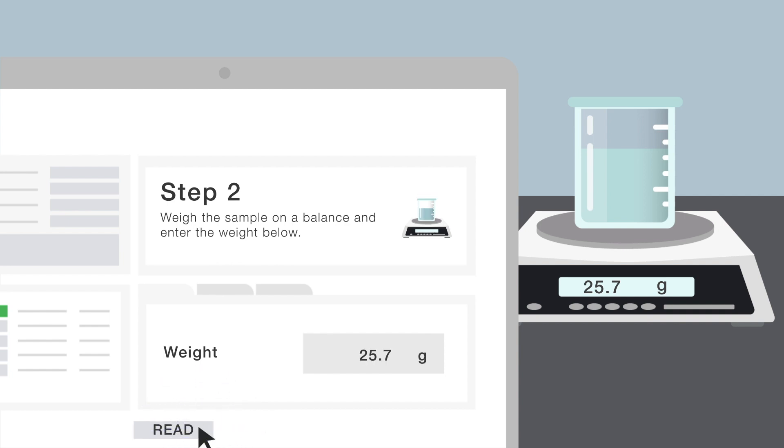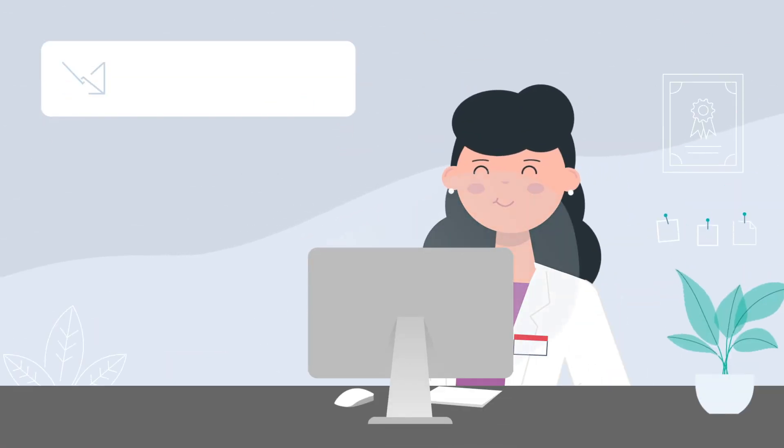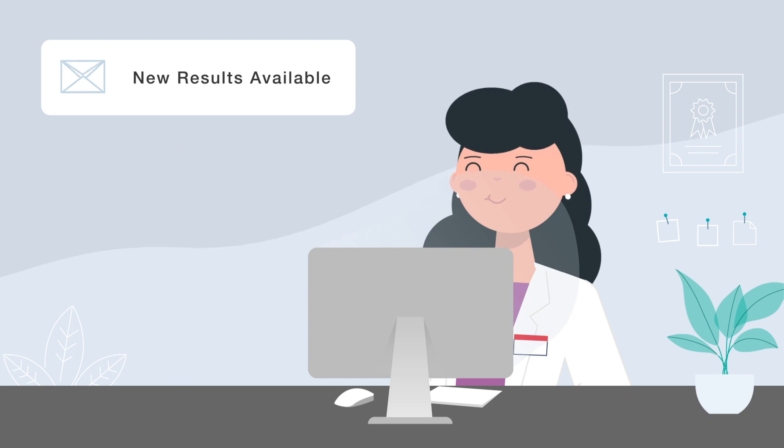By the end of the procedure, there is no information to transcribe to Sample Manager LIMS software, and all the details about the procedure are instantly available to the lab manager or whoever else needs access to it.